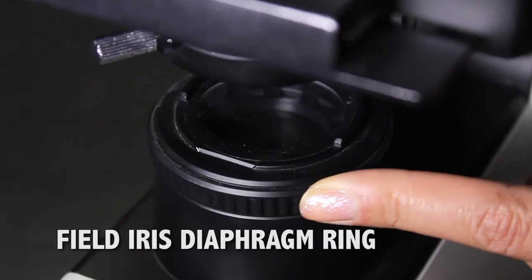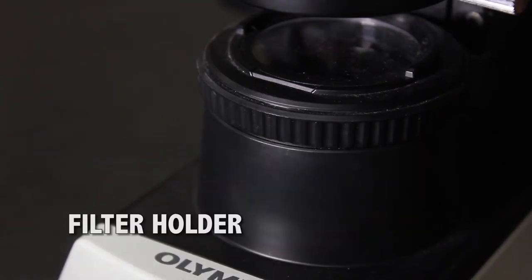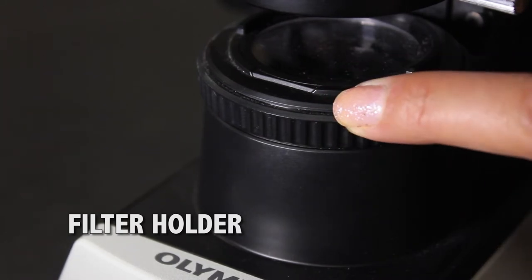Field iris diaphragm. Filter holder, this holds the filter for the light.